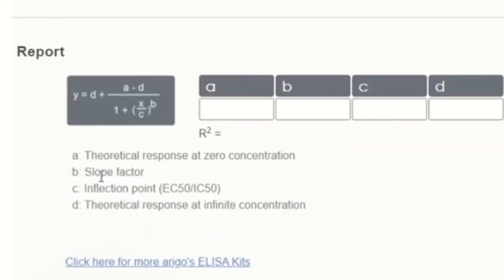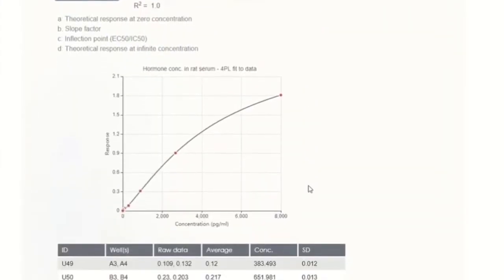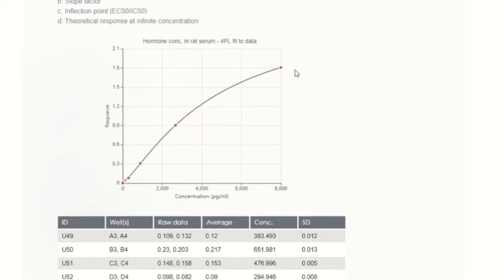When you hit analyze, the four-parameter logistic applies four parameters to determine the equation of the line: parameter a is the theoretical response at zero concentration (no hormone present); b is the slope of the curve; c is the inflection point, which may equate to your EC50 or inhibitory concentration 50; and d is the theoretical response at infinite concentration. The software then produces a line of best fit.